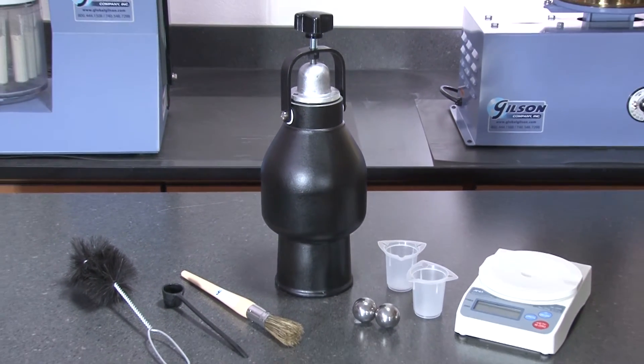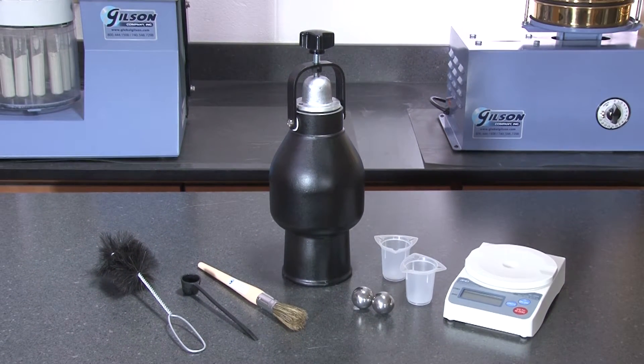The Gilson MA26X AquaCheck is significantly more affordable when compared to the more expensive Speedy 2000 Moisture Tester model.